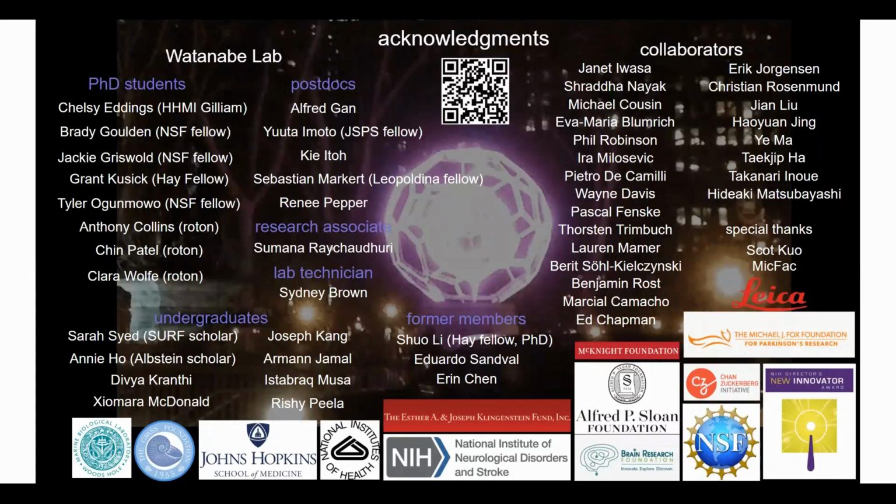Great, thank you. Now, what is your favorite cryoprotectant for neurons? Okay, so we actually do not use any cryoprotectant for cultured neurons. Because they are basically on the sapphire disks, they get frozen right away. And so we don't use any cryoprotectant.